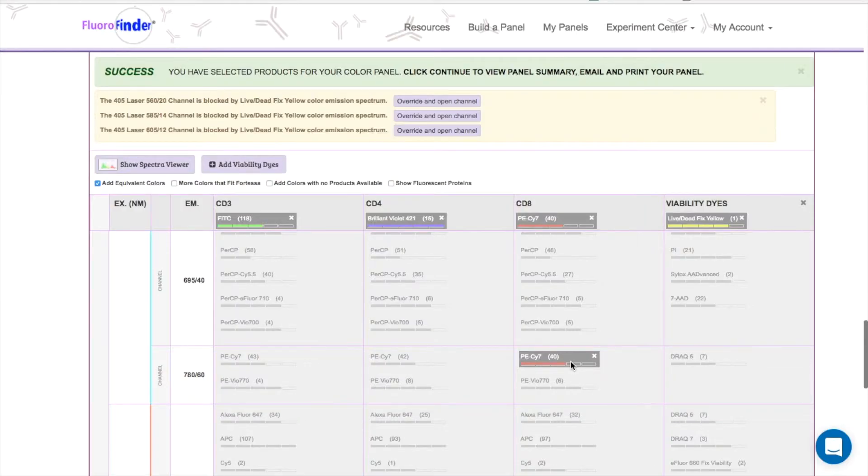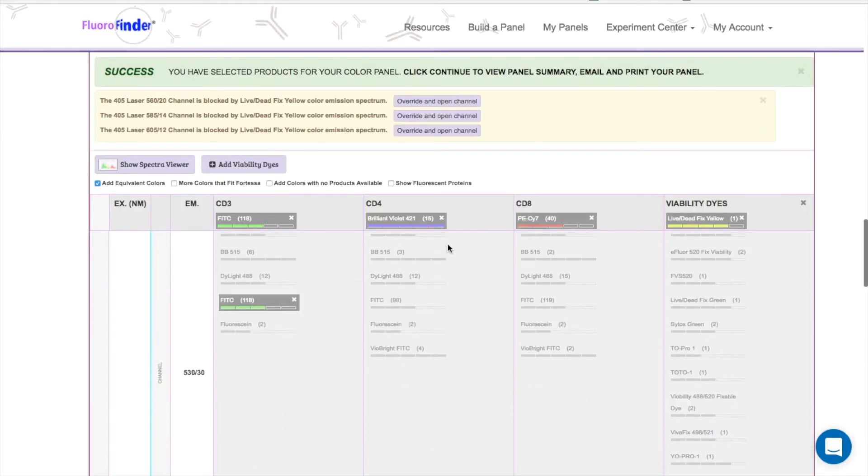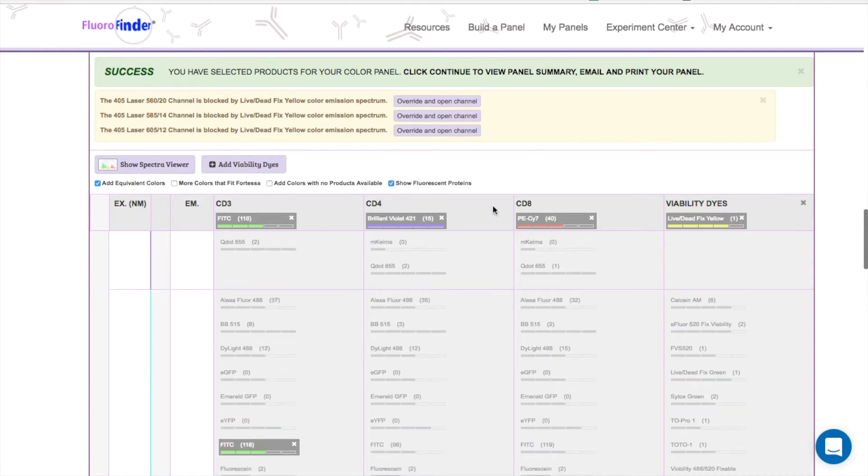You can also associate your markers with fluorescent proteins in this step. To do this, you just click this box, and you'll see all fitting colors added into our existing list.